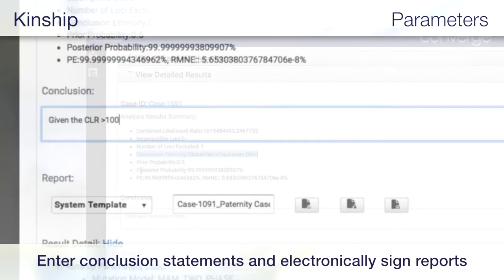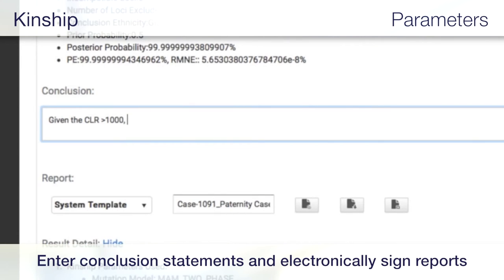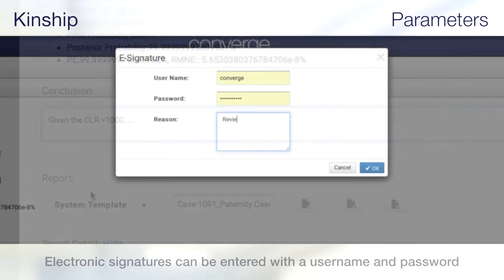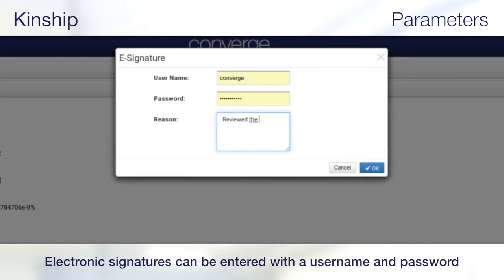Once satisfied with the results, users can enter the conclusion statement, as well as generate and electronically sign reports in a few simple steps. The e-signature can be entered with a username and password, and you can also provide reason for approval.